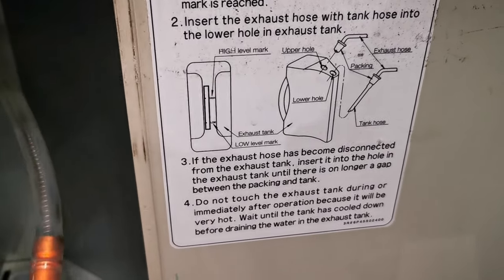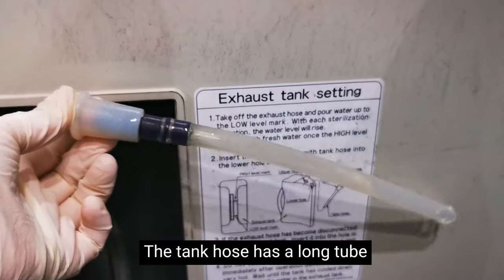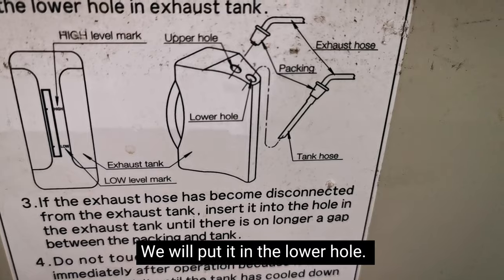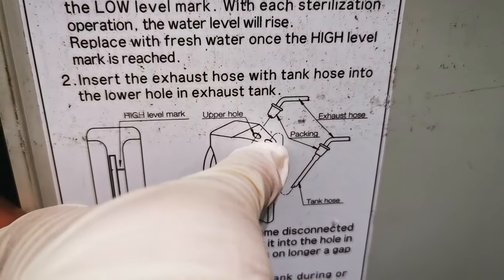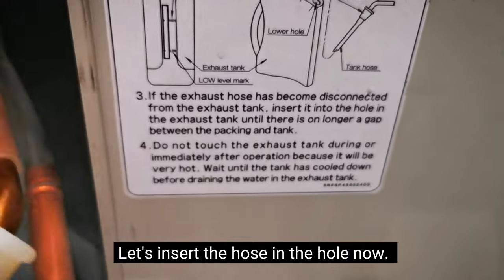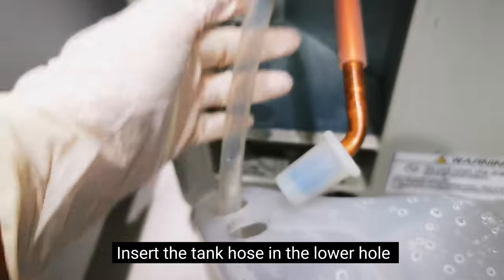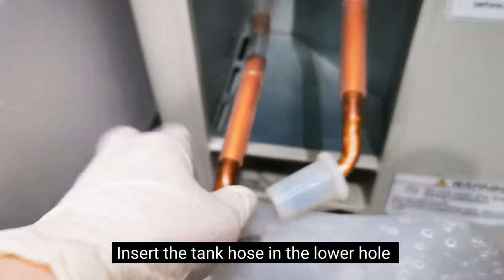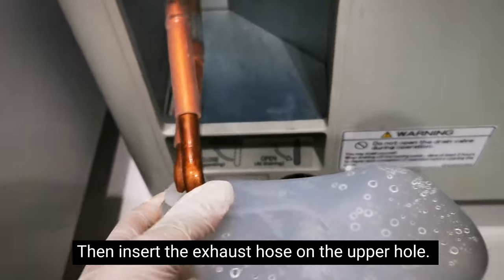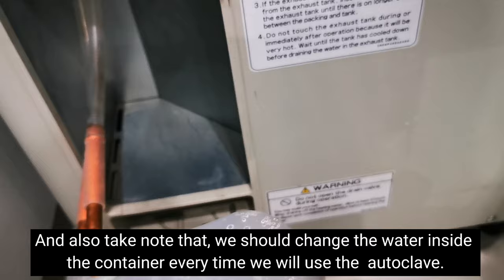The tank hose is the one with a long tube inside. We insert it into the lower hole. The exhaust hose, the short one, we insert into the upper hole. So that's the correct procedure for inserting the hoses.